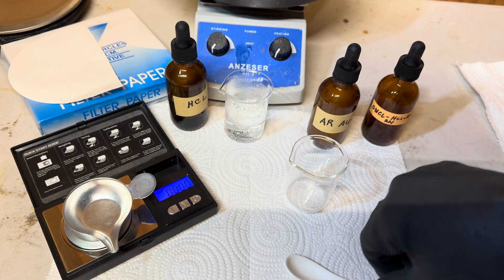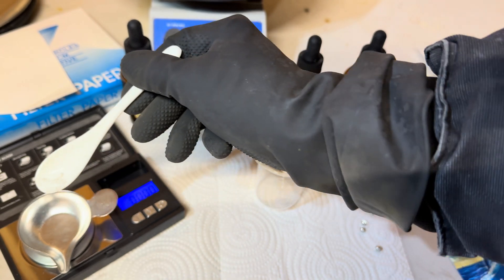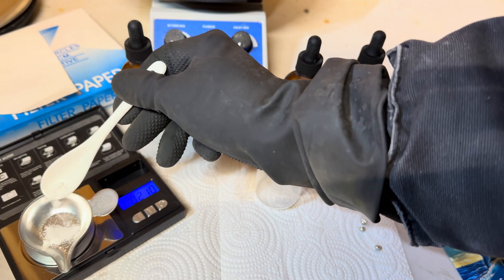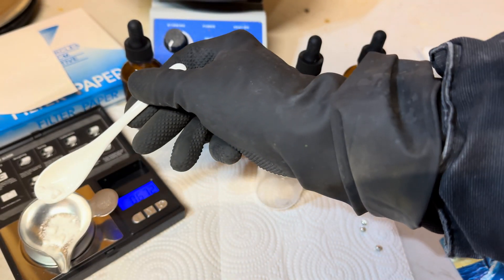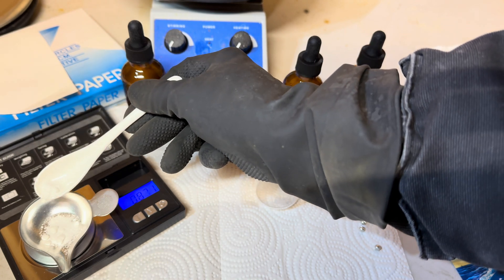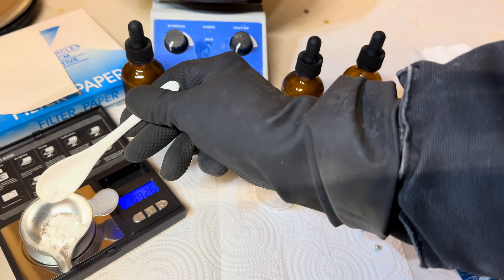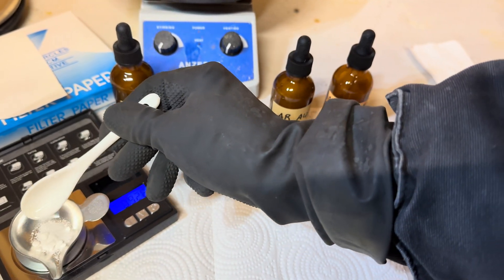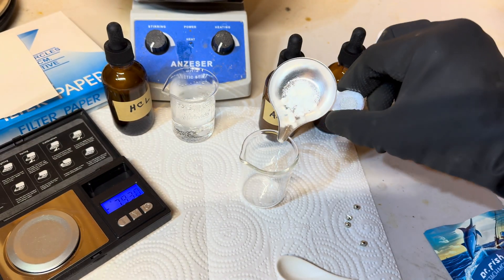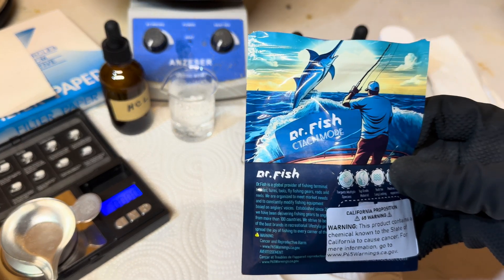We will first weigh out one gram of stannous chloride crystals and add it into the beaker. Next, we will add in one gram of pure tin.